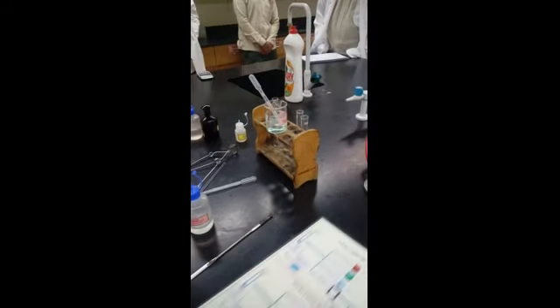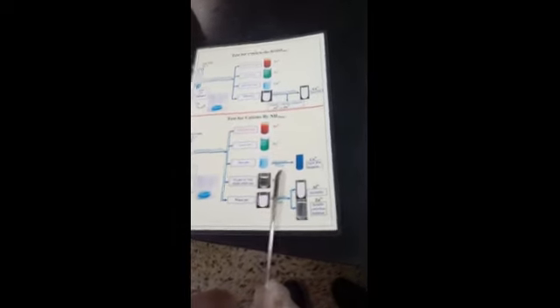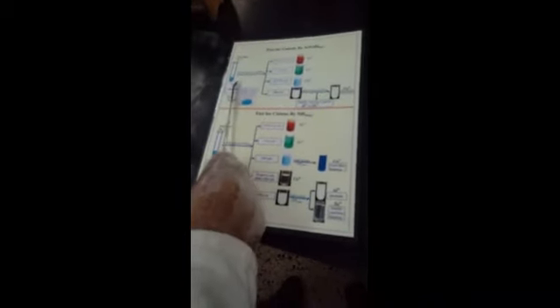And let me go to the card and see what they are telling here. The card says, when I put few drops, I get blue color. So I come to the blue color one, but it is not giving any answer. It says you have to continue. You have to add excess amount. Excess ammonia. That means the same chemical, they ask you to add more.